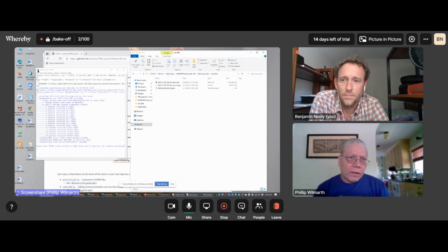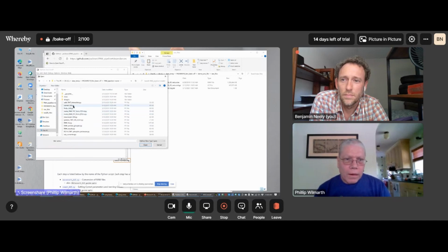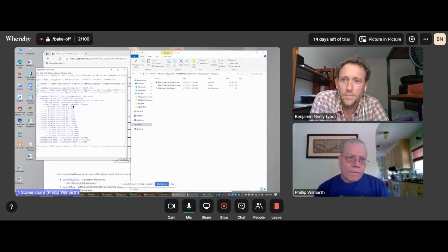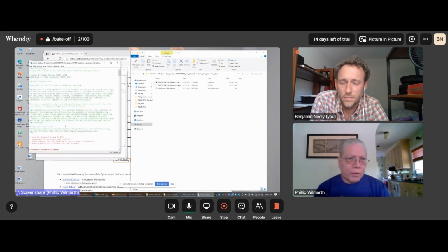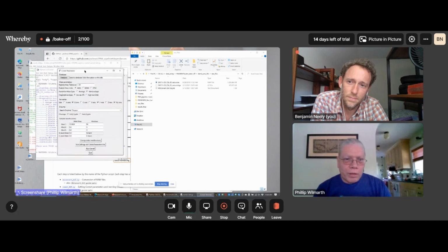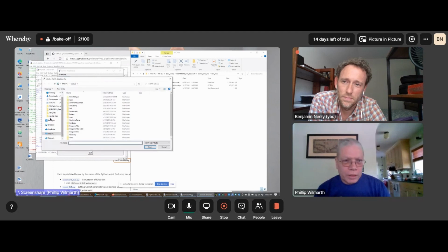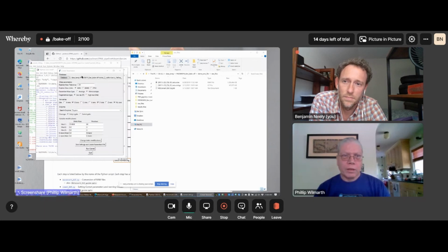Okay, so that is done. So now we're ready to go to the Comet step. Again, we just run the script, F5 or the run menu. Now we get a dialog, kind of a form, for the Comet parameters. First thing we can do is select a FASTA database file. And I'll put that in here as well, the California Sea Lion RefSeq.